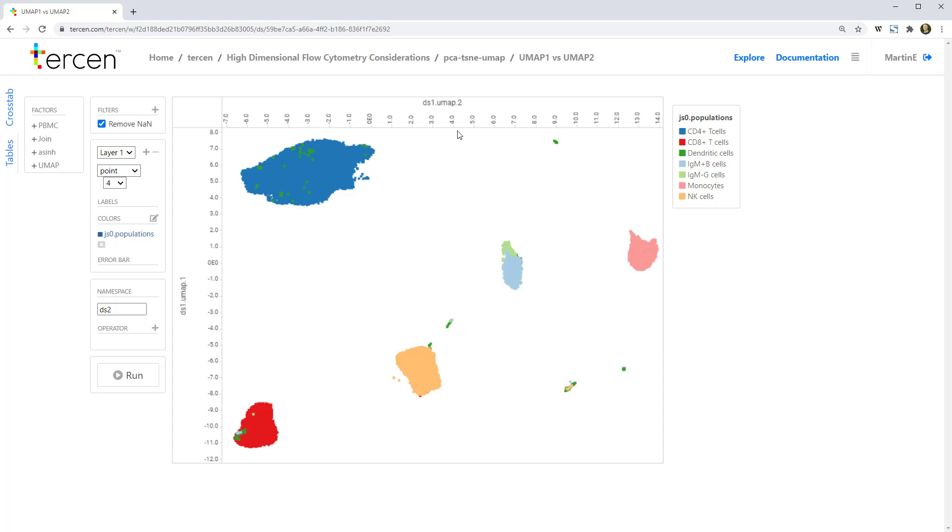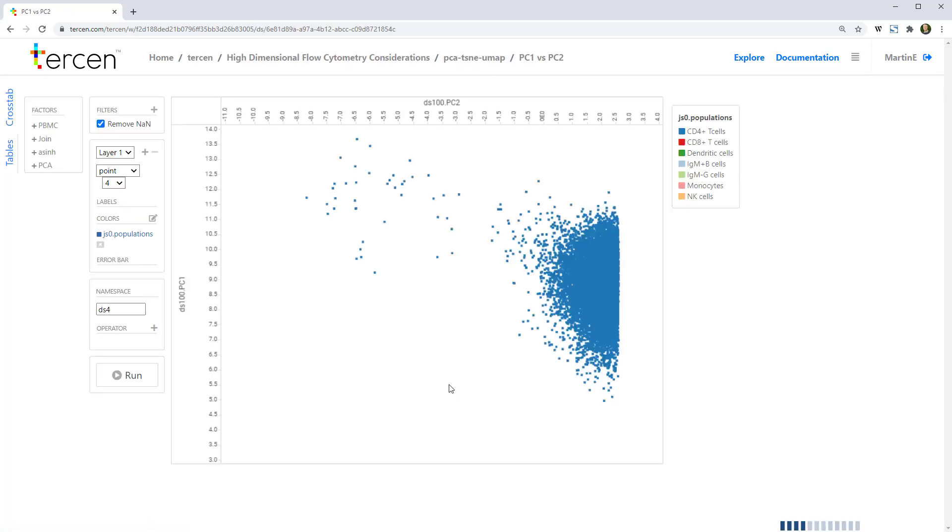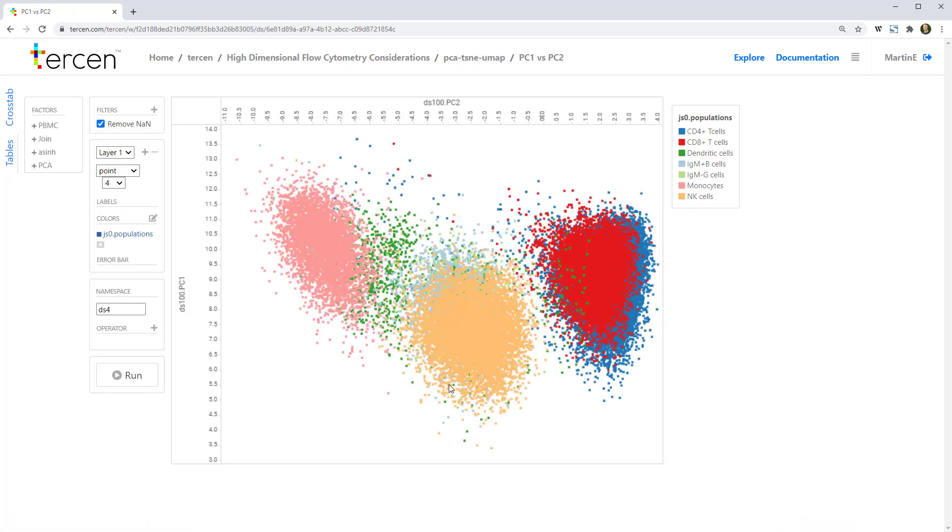Just for comparison, we added a PCA reduction, which you can see doesn't perform very well. It struggles to get the T cell populations separated.